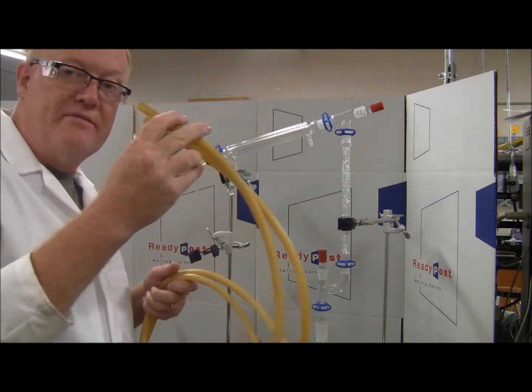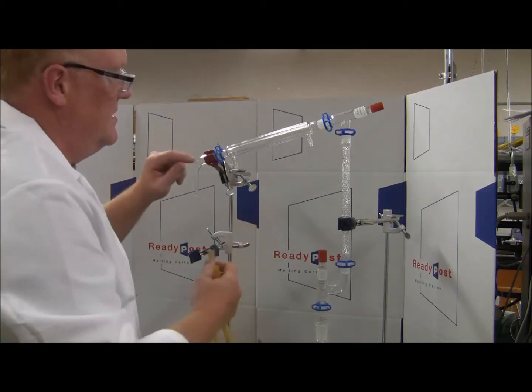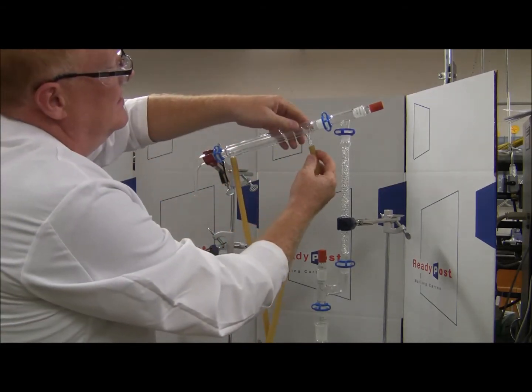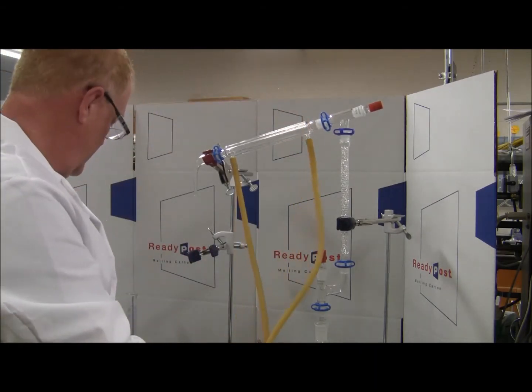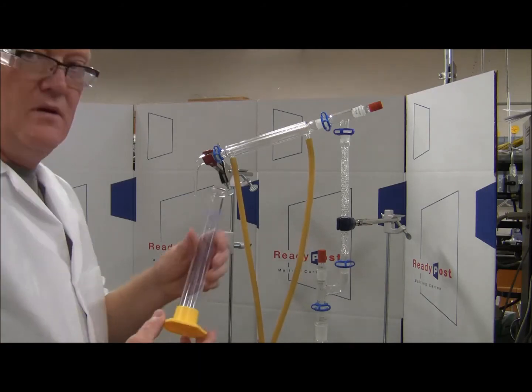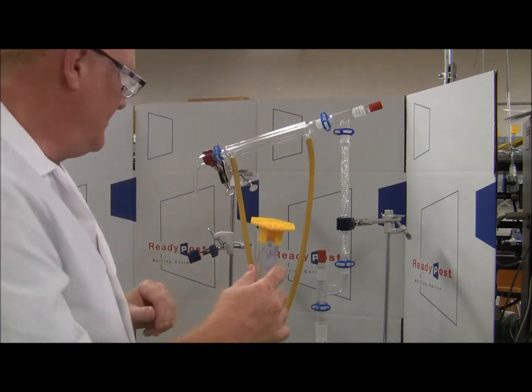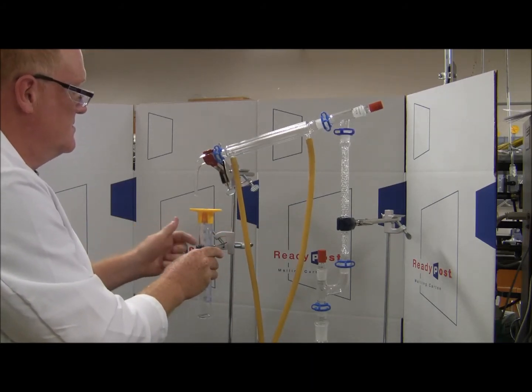Your kit comes with 10 feet of hose. You can cut this as you need to work within your lab. The hose from the water source goes on the bottom fitting, and the drain goes on the top. We're going to be using a graduated cylinder, and we're going to start out using this a little bit backwards. We're going to turn it upside down and use the bottom as the base. So we'll go ahead and get this fixed up in here.